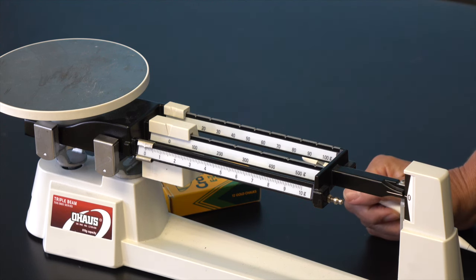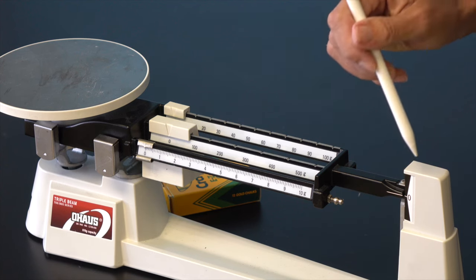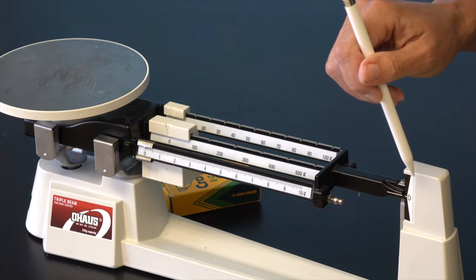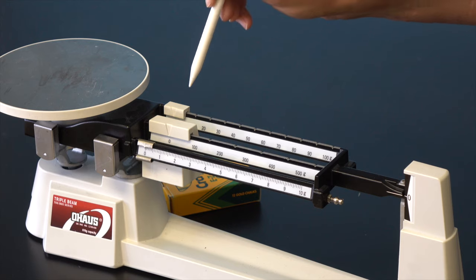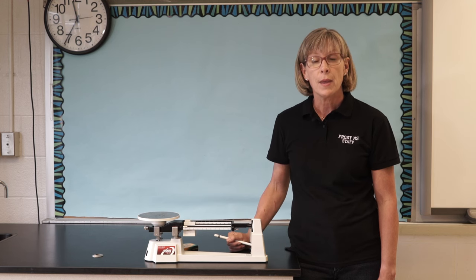When measuring mass, the first thing to do is to make sure that your pointer lines up exactly with the zero while the riders are each on zero. If that's not the case, tell your teacher so that he or she can make the appropriate adjustment.